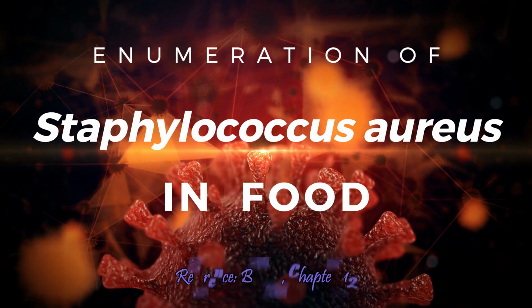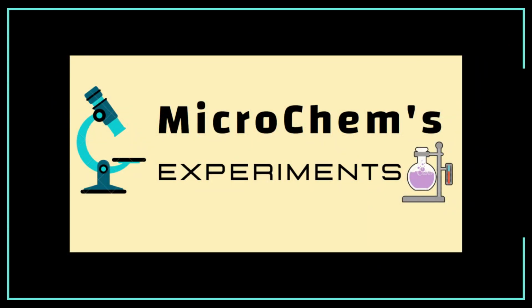Today, we're going to perform one of the most crucial and highly requested microbiological analyses in food safety, the enumeration of Staphylococcus aureus. Welcome to Microchem's Experiments. Be with us, be a laboratory expert.